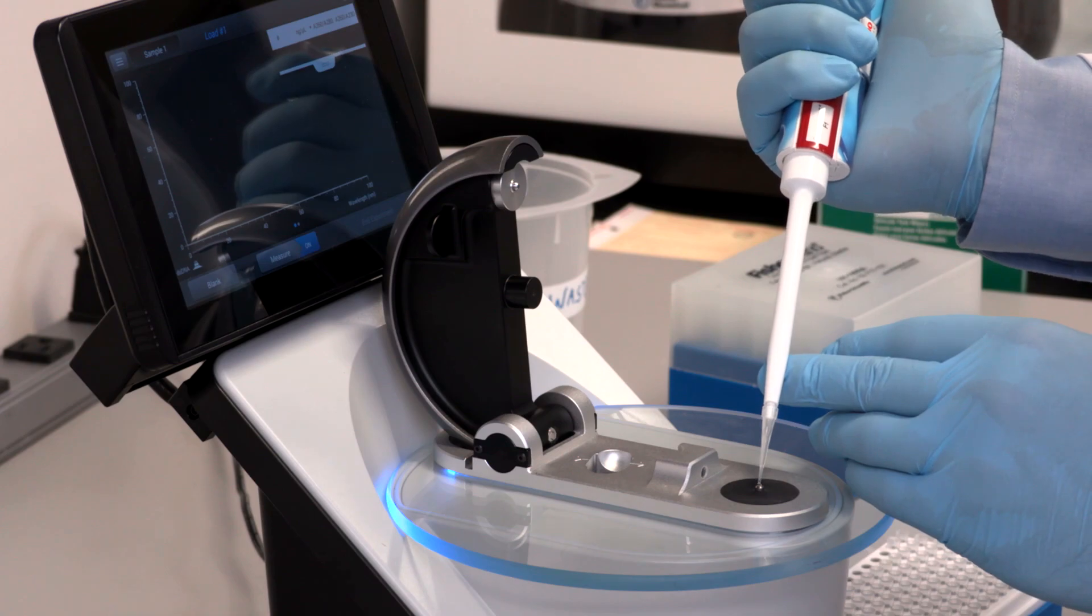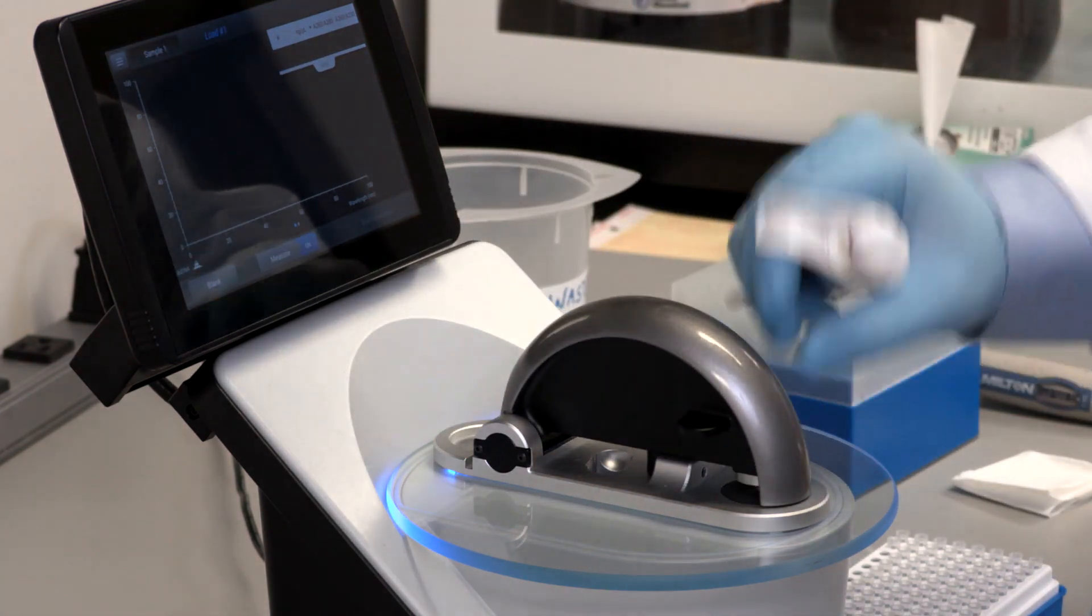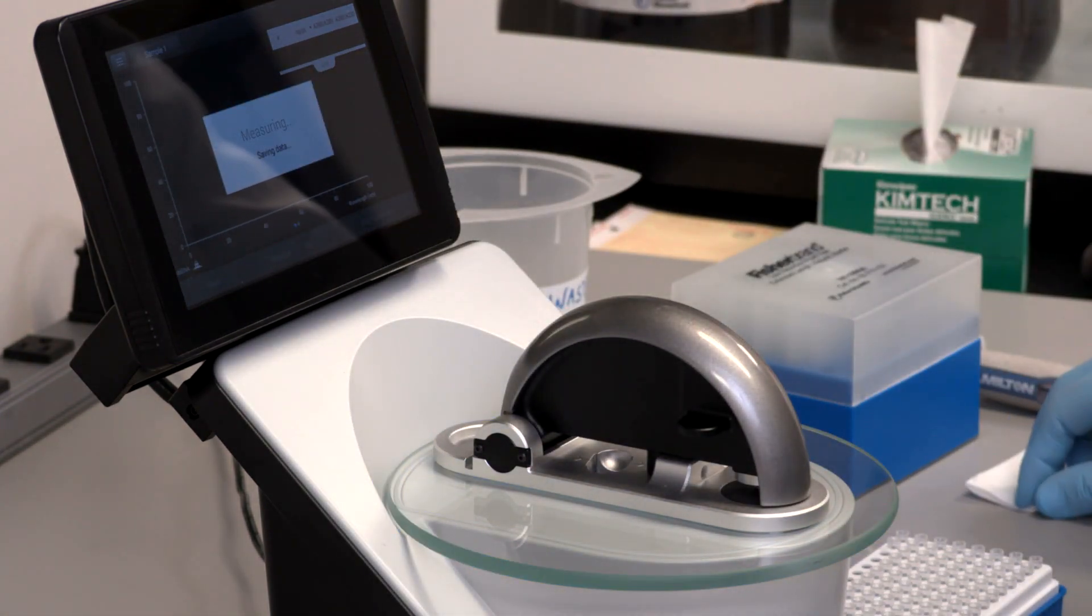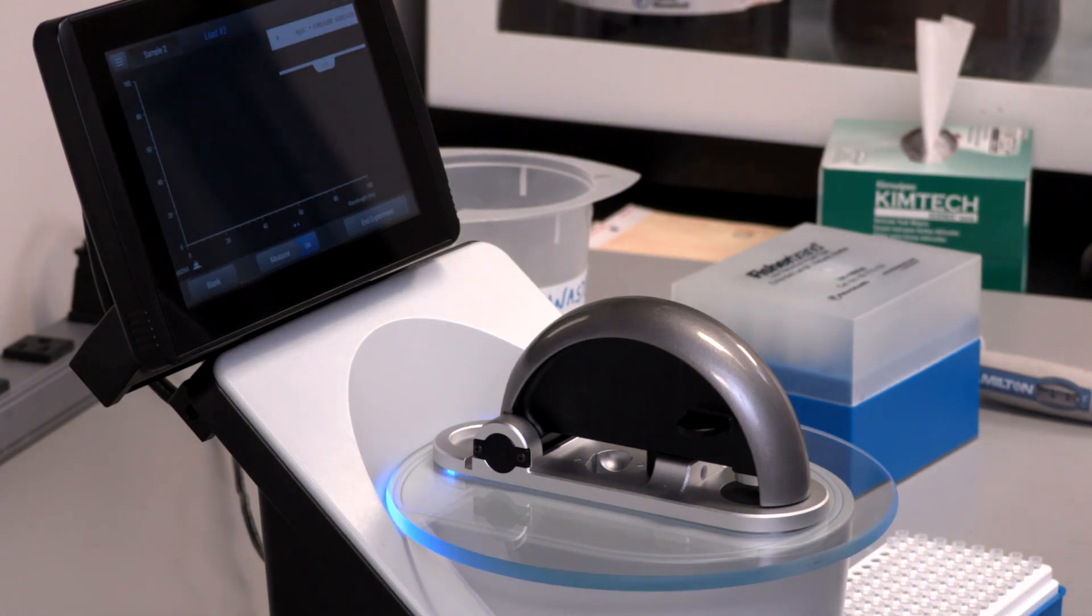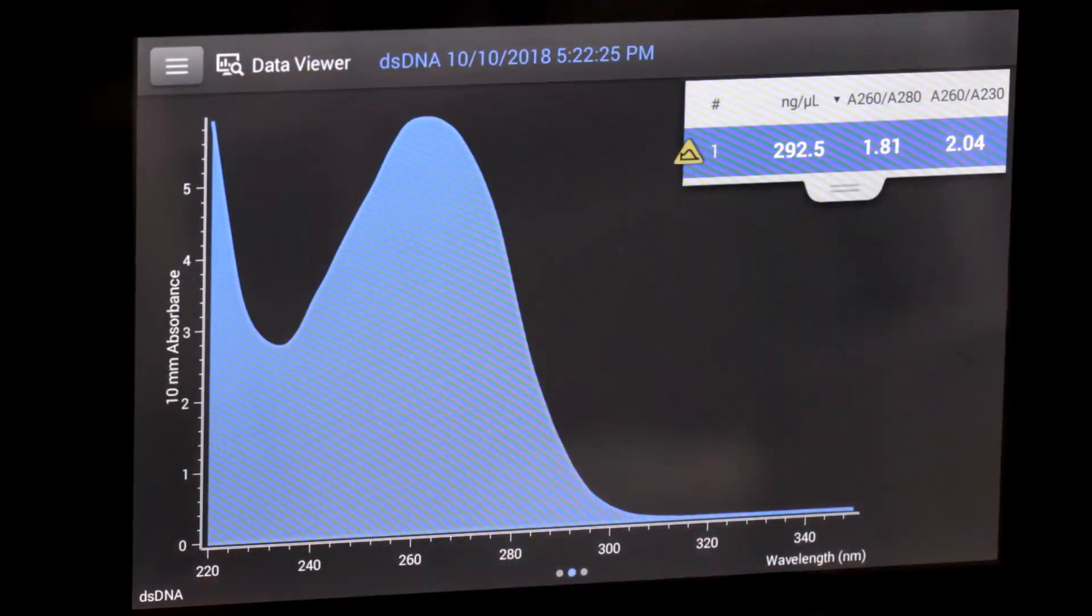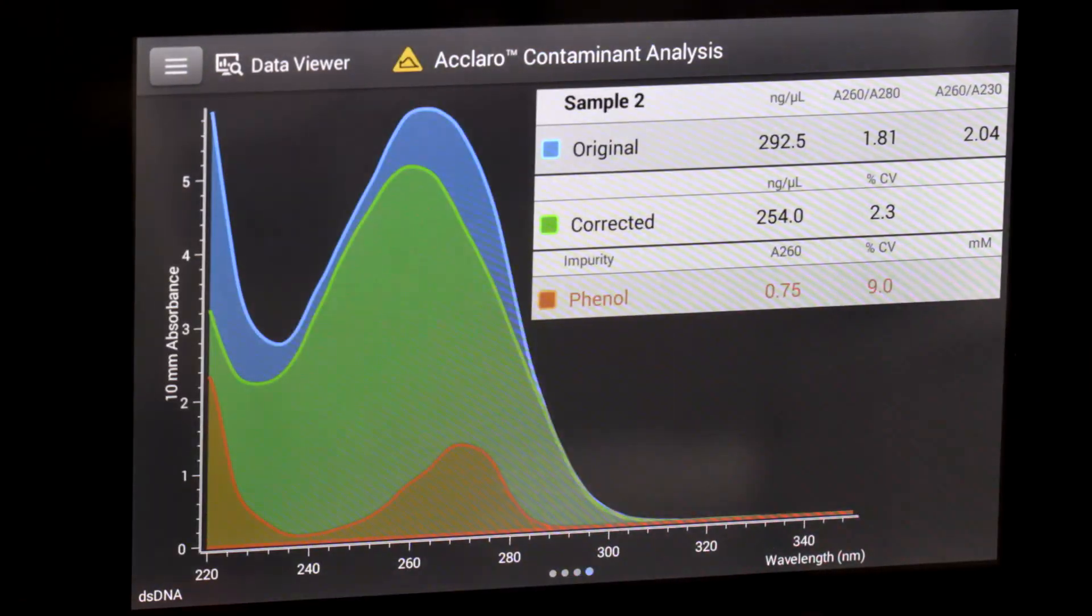This software is called the Thermo Scientific Acclaro Sample Intelligence Technology. It identifies the presence of common contaminants in your sample and calculates an approximate concentration of the contaminant. The software displays a yellow triangle when it identifies a contaminant.